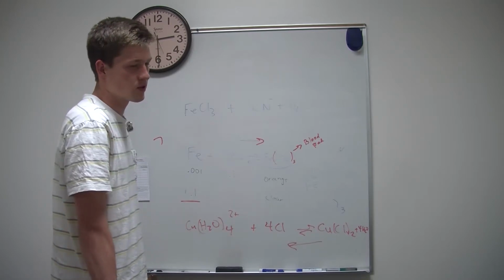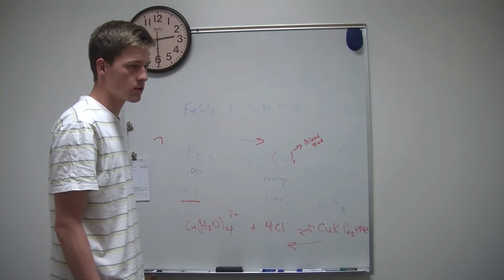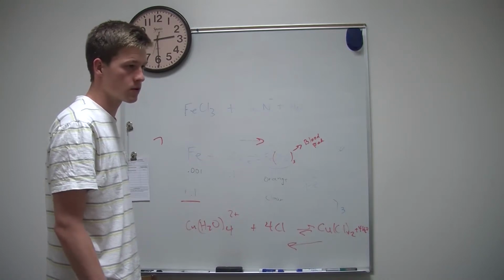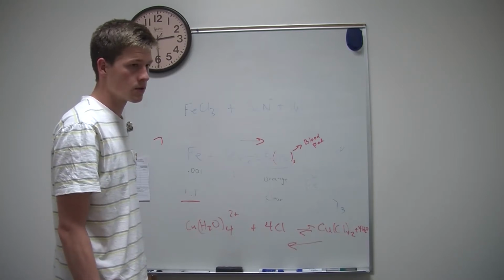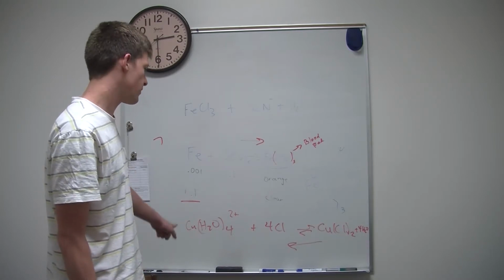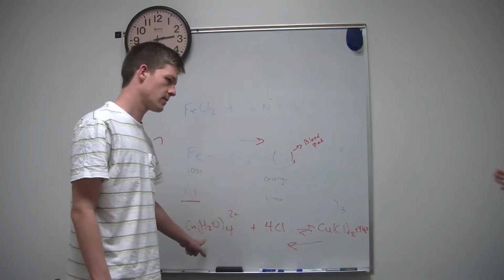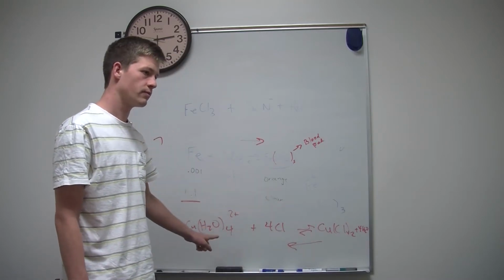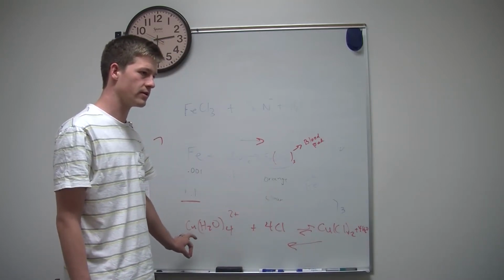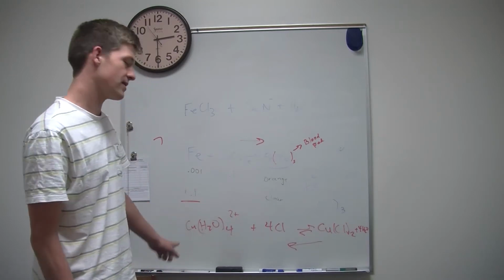So how do you explain the color change? It just goes clear. Did yours give you color though? No, I didn't actually look, but I imagine it would have been a faint blue. Wait, so what happened in the experiment? Originally it went from blue to green, and then you add water and it turns clear, but with a faint blue. I would assume neither of us paid that close attention. That would make sense. Okay.